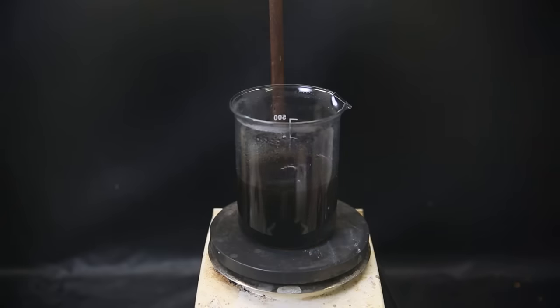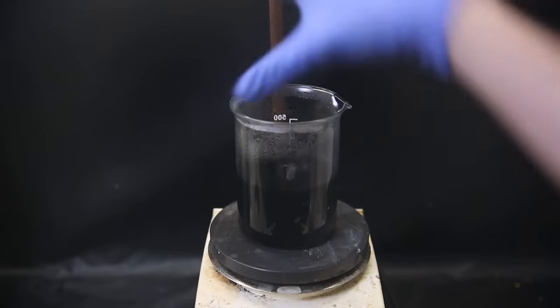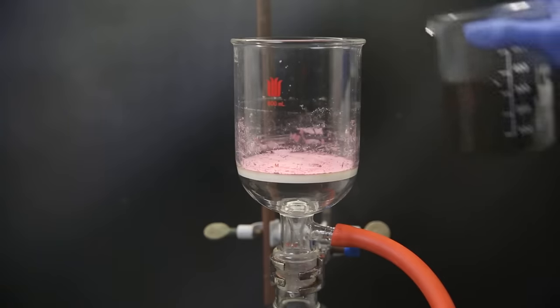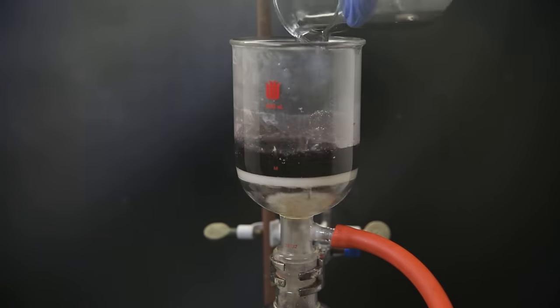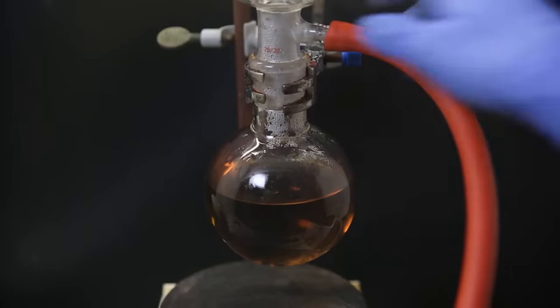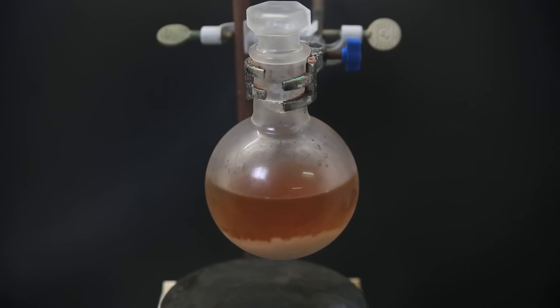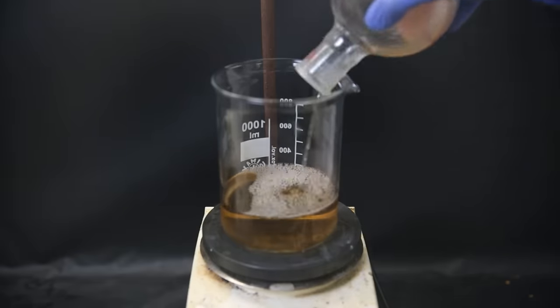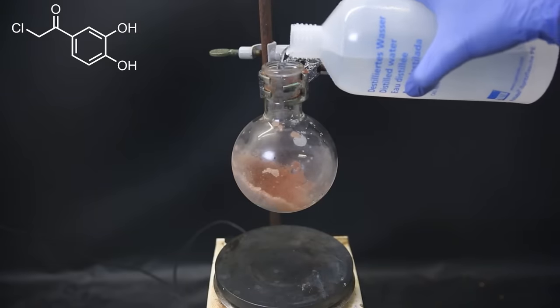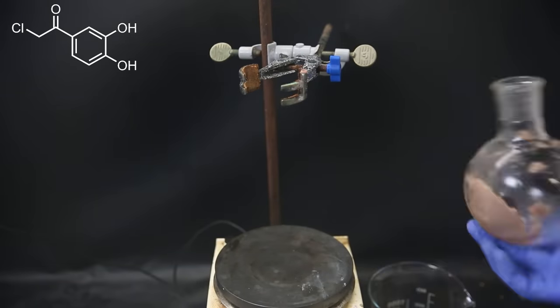I let it stir for a few minutes, though it's best to do it a bit longer, but again, impatience. I then filter it through the same filter because I don't feel like cleaning that. The filtrate looks the same. I then let it sit in the fridge overnight and a bunch of solid has crystallized out. I decant off all of the liquid and wash the solid with some water to get rid of the acid.